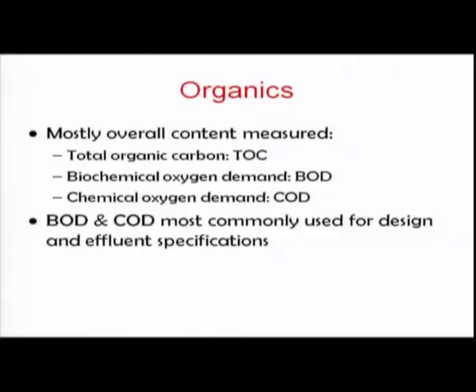The organic matter determination is usually done in wastewater, not in drinking water or surface water, but again it indicates some kind of contamination. The values should be very, very low if the water is used for drinking purposes. The organic matter content can be determined by TOC, total organic carbon. It is an instrument based technique, using a TOC analyzer. BOD we can do by titration or a DO probe method.